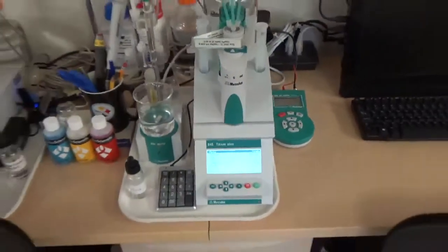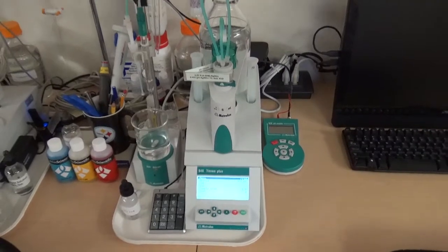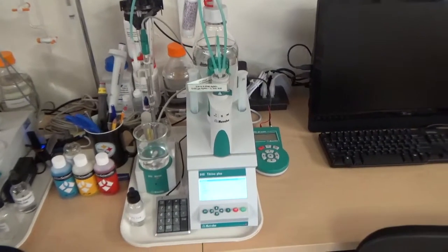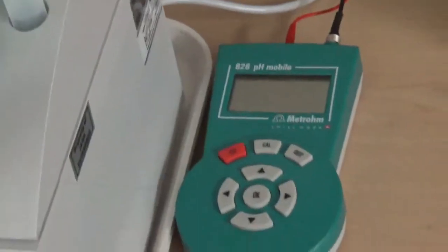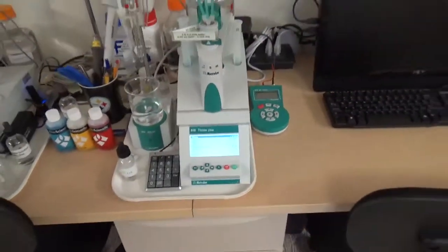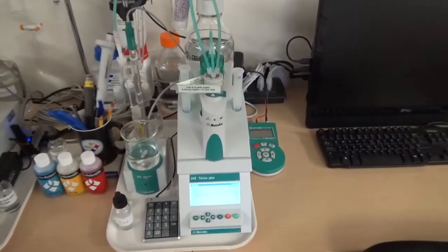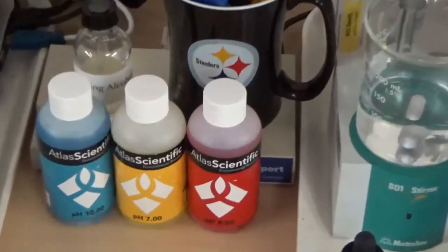This second setup uses a Metrohm 848 Titrino Plus, which is used for acid-base titration, determination of pH, or alkalinity of concrete. To calibrate it, we also use a portable pH meter with its own pH electrode. The 848 Titrino Plus is used for regular acid-base or alkalinity titration, using pH buffers to calibrate the pH meter.